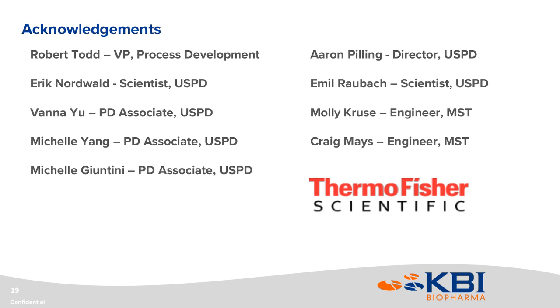For those increased run rates, I would say in a typical week where we may be able to do one stainless steel fermentation set, maybe a 48-hour fermentation or something of the like, we're now able to do two, just because a lot of the supporting activities are omitted from the single-use systems.